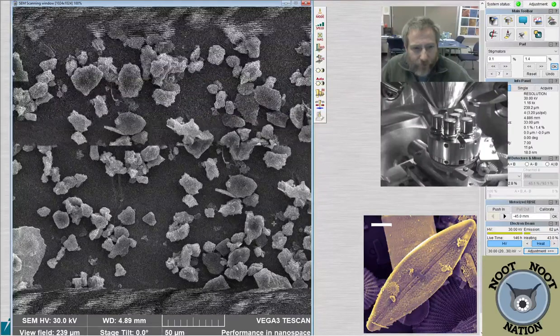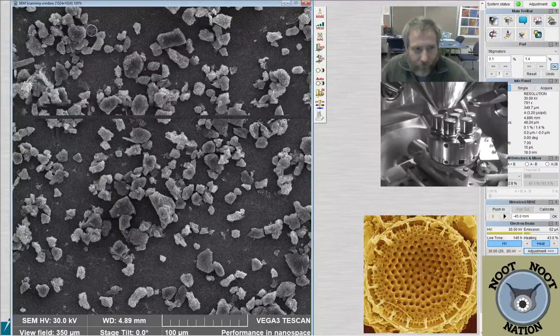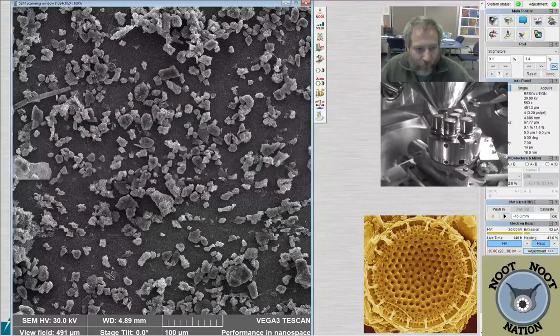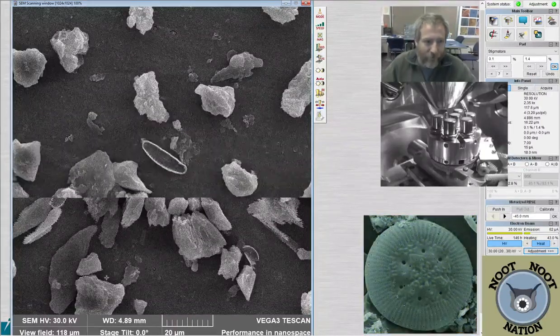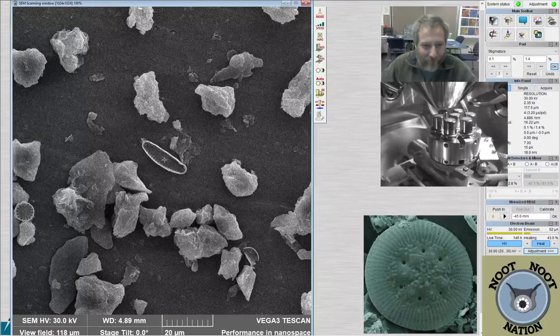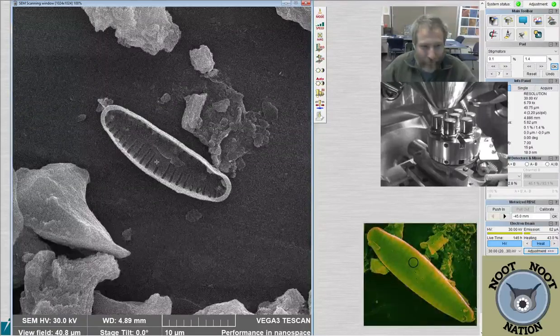And then we had something over here that I wanted to look at, which is where I'm going. Like with the light microscope, in the SEM we just sort of learned to memorize landscapes and shift around. I remember there was a thing, it was this direction, and that only matters if I tilt or rotate the stage, then it becomes problematic.